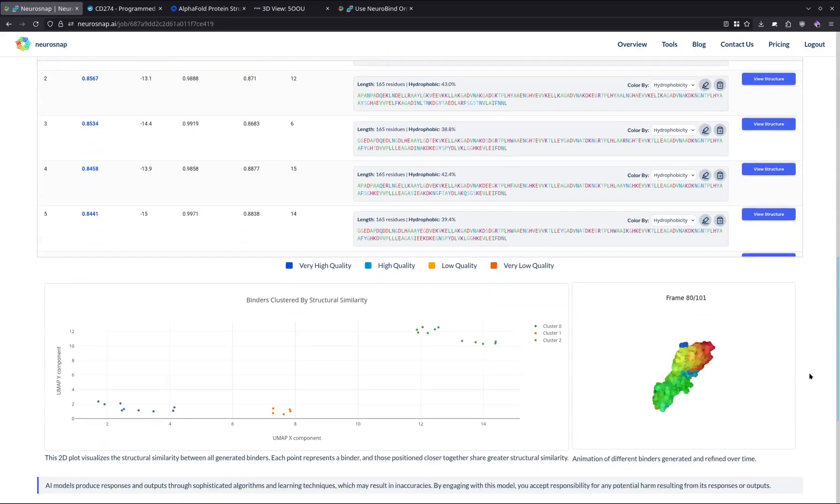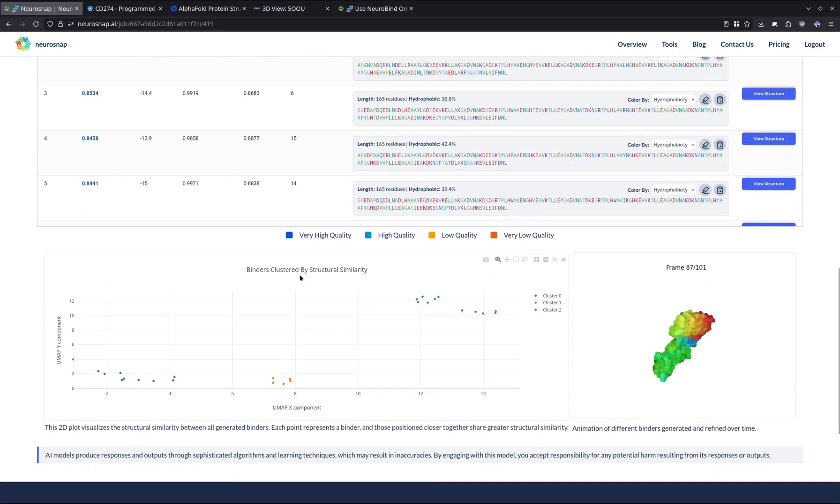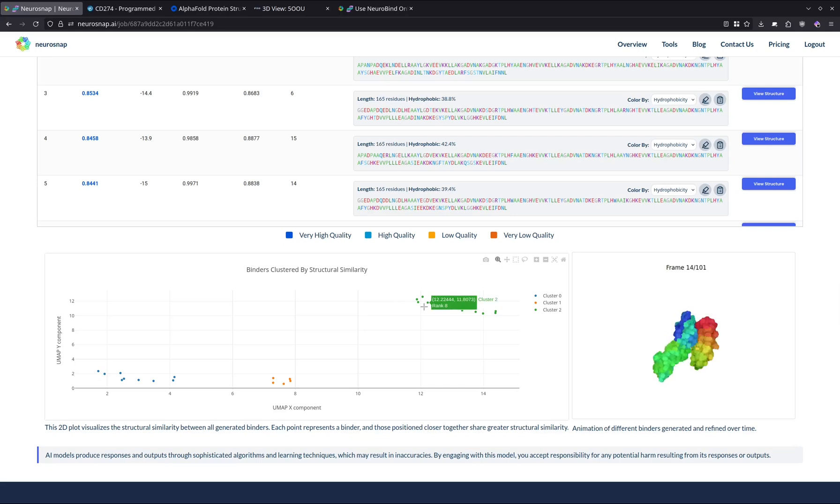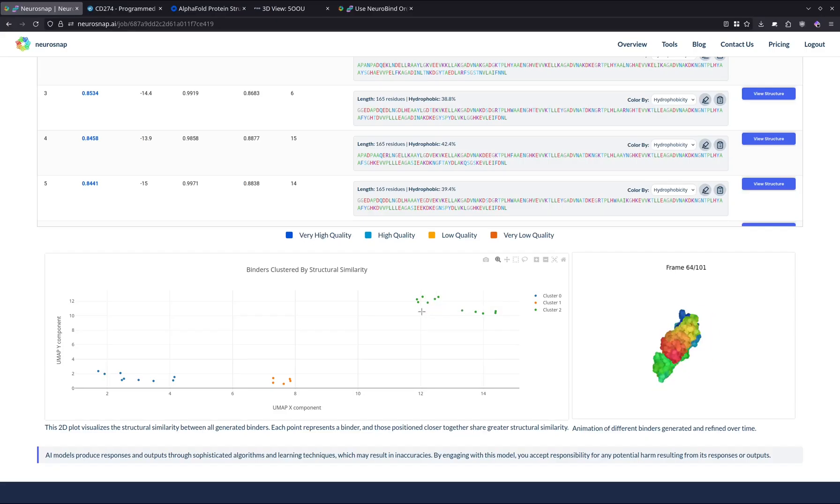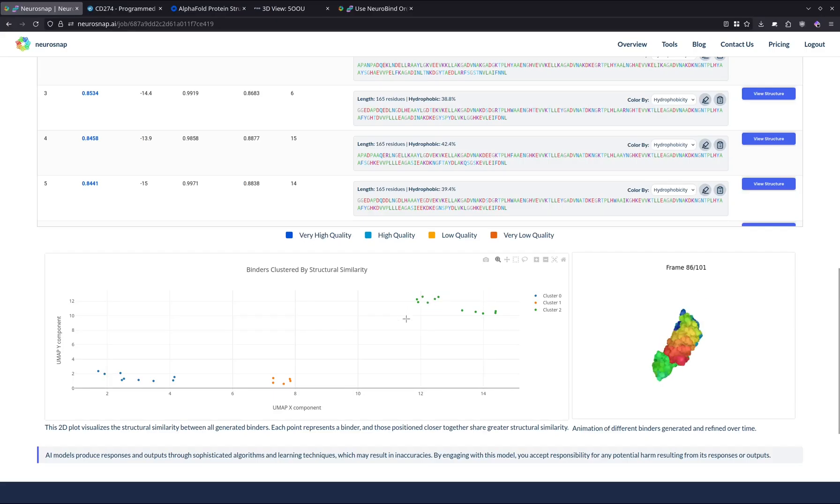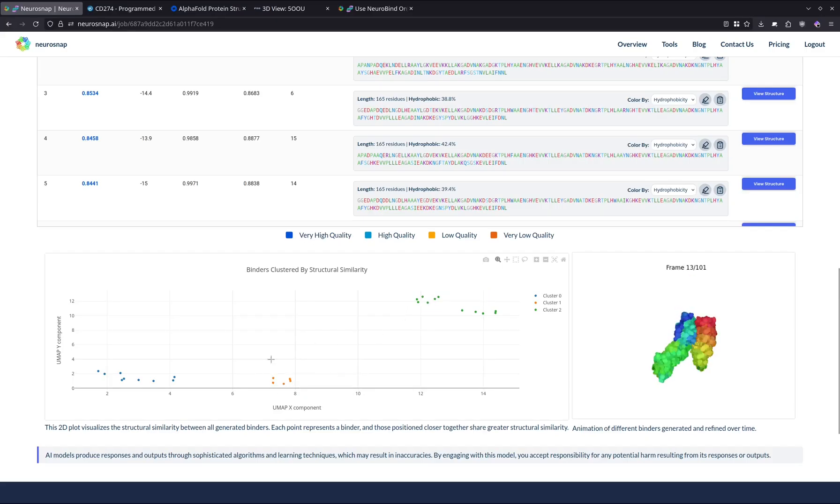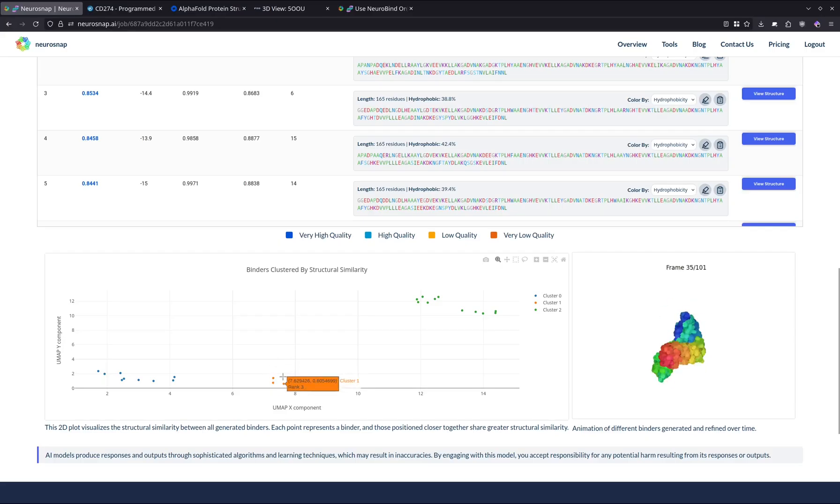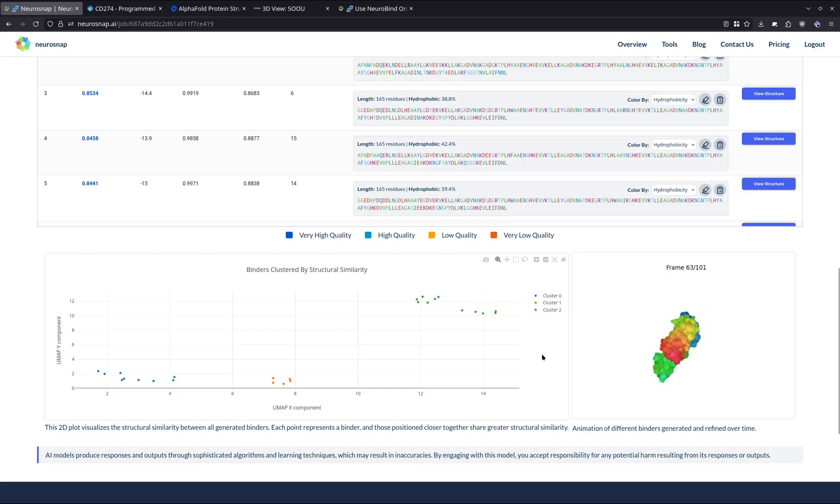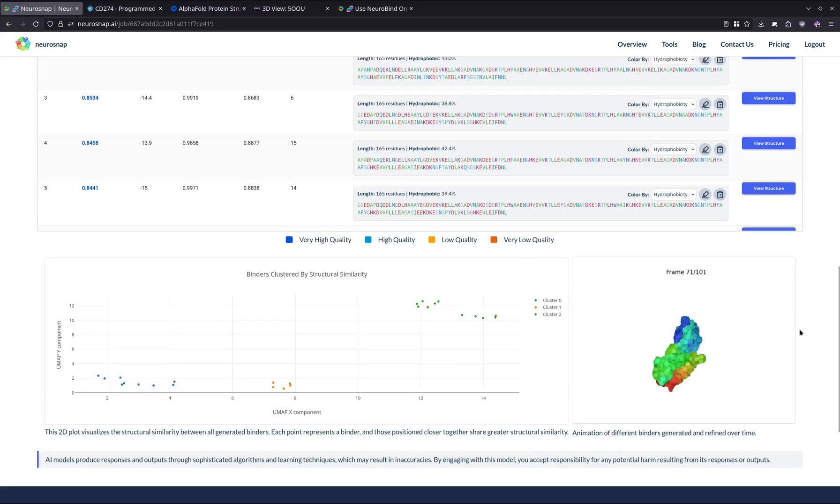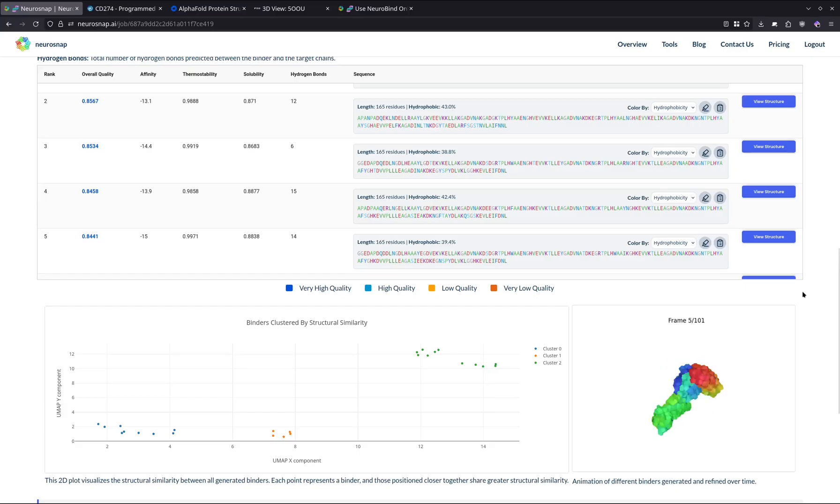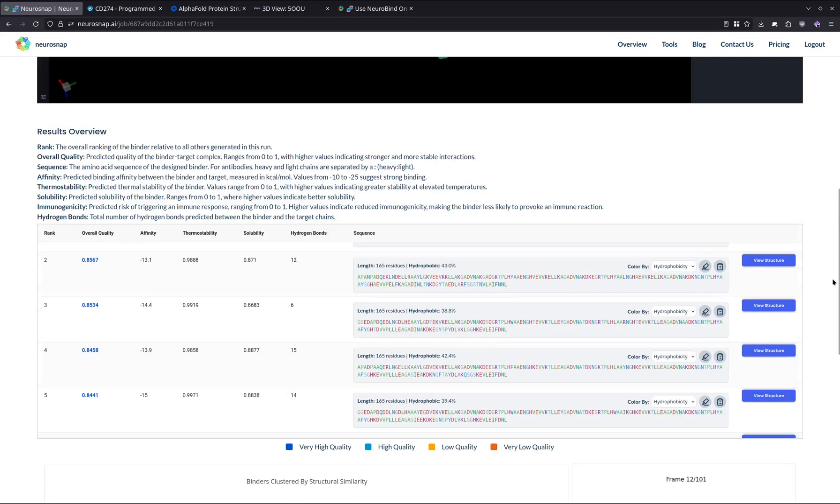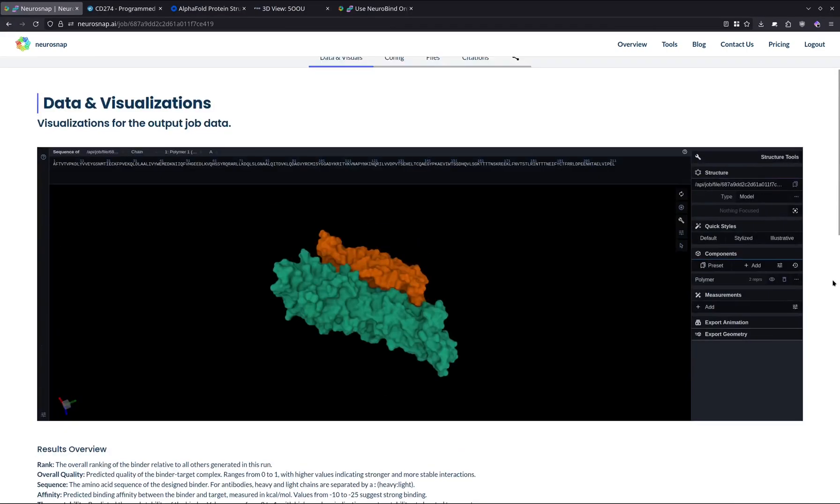The next thing we're going to be doing is taking a look at the binders, which are going to be clustered by structural similarity. What the scatterplot represents is we compare all the structures against each other and we essentially project how similar they're going to be using a UMAP. In this particular run, it seems that we have three different groups of structures where this orange cluster slash yellow cluster over here, all these structures are going to be somewhat similar, and the blue and green ones are going to be more similar to one another comparatively. This could be very useful in case you want to take a look at some of the structural variability in the actual designs that were outputted by this model.